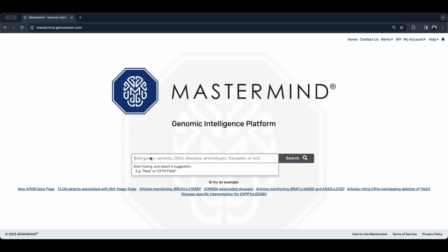In this video, we'll cover the key features and functionalities available in the Professional Edition of Mastermind. Whether you're new to the system or a long-time basic user, keep watching to learn how you can get the most out of your professional license.